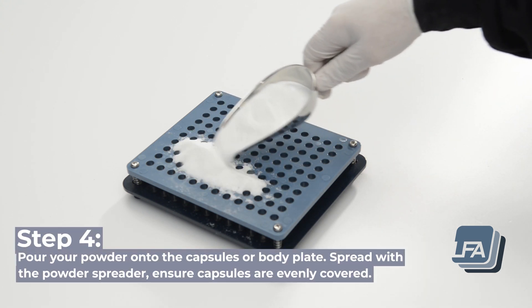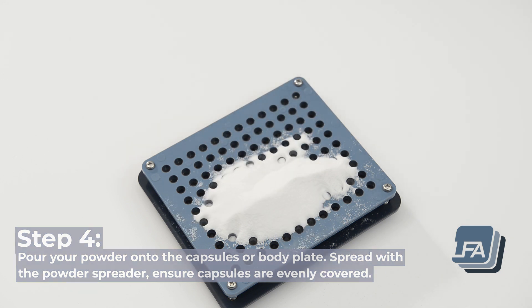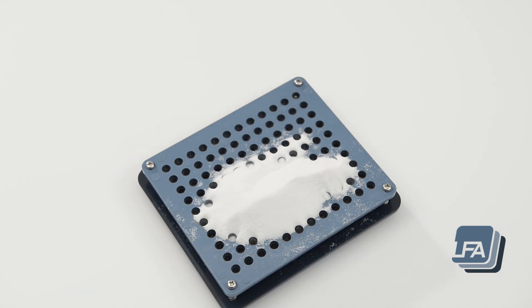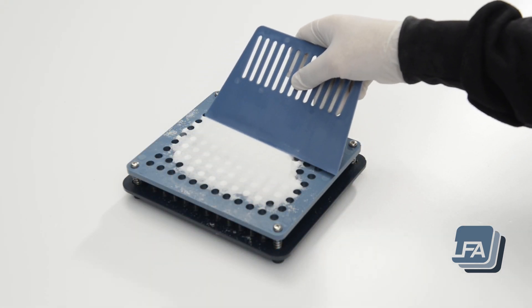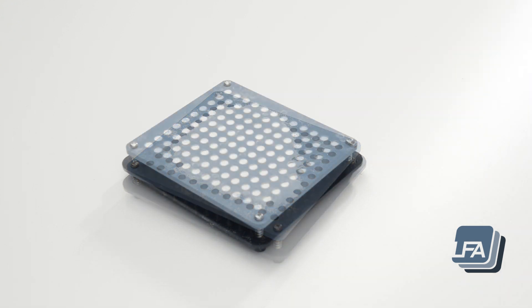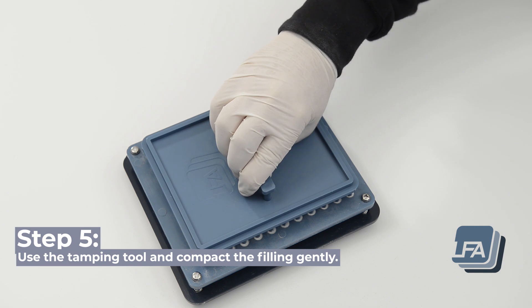Step 4: pour your powder onto the capsules or body plate. Spread with the powder spreader, ensuring the capsules are evenly covered. Step 5: use the tamping tool and compact the filling gently.